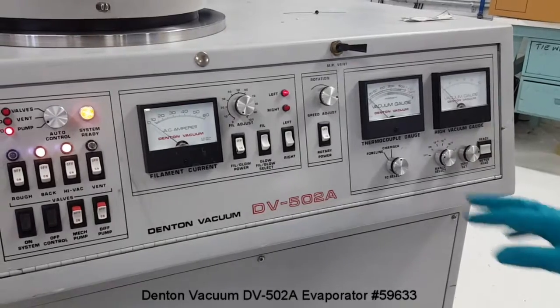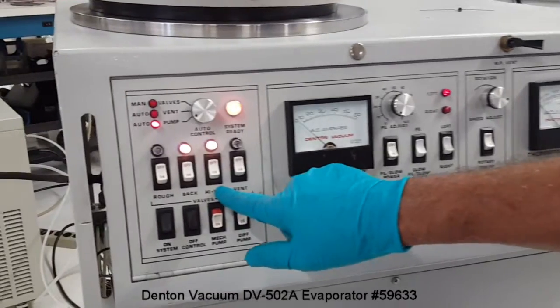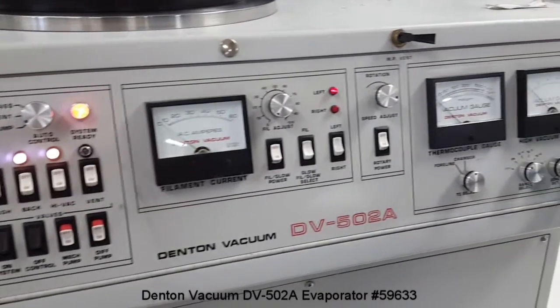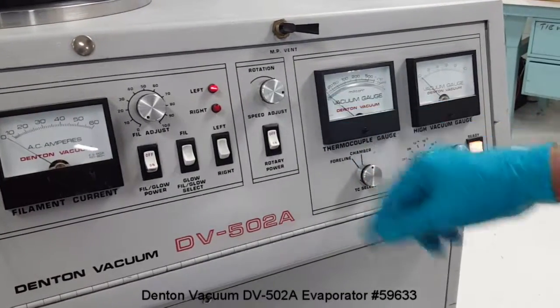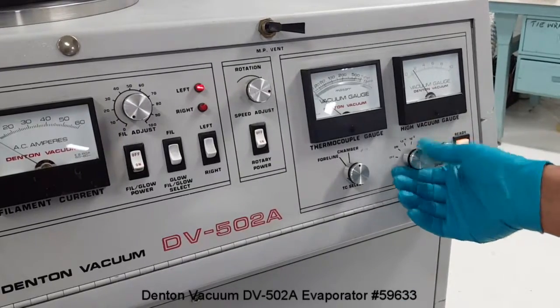After the chamber roughing, the system opens the backing valve and high-vacuum valve, and now the chamber is getting into high vacuum. Once the high-vacuum valve is open and we see the chamber roughing vacuum gauge is below zero, it's time to turn on the cold cathode sensor.